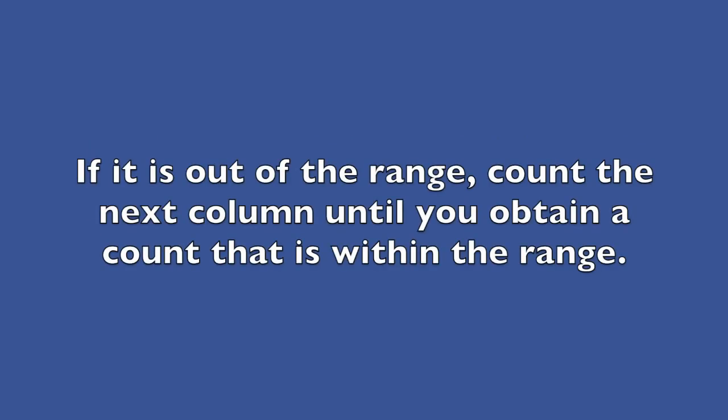If it's out of the range, move on to the next dilution column and repeat the process until you obtain a plate count that's within the range.